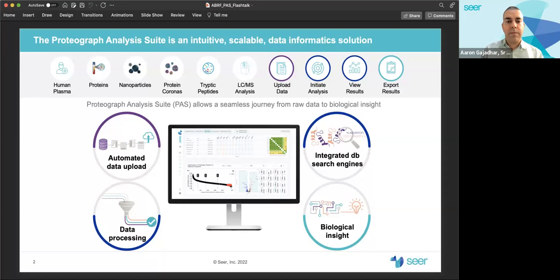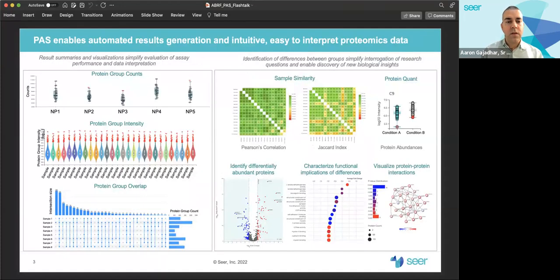PAS supports automated data upload, data processing, integrated database search engines supporting both DIA and DDA LCMS data, and visualization tools for biological insights. Analysis and results visualizations are all built into an easy-to-use browser suite and simplify the evaluation of assay performance and data interpretation.